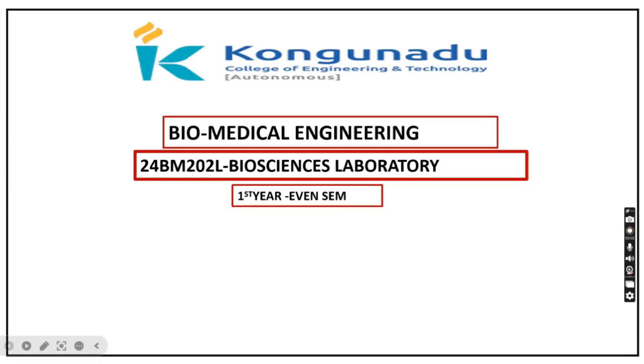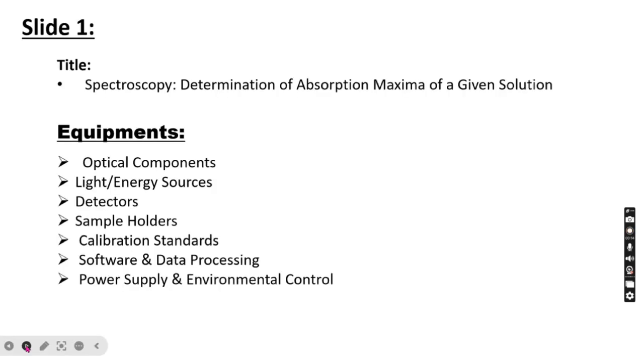Good morning everyone. Department of Biomedical Engineering. Subject code 24BM202L. Subject name Bioscience Laboratory. Let's see slide 1. Title: Spectroscopy Determination of Absorption Maxima of a given solution.